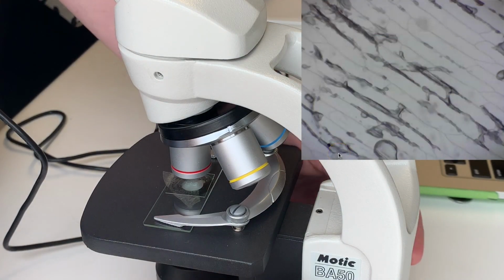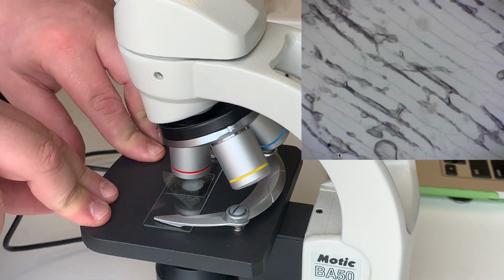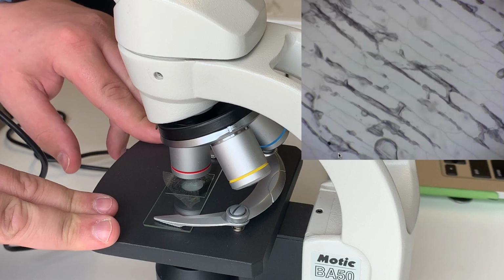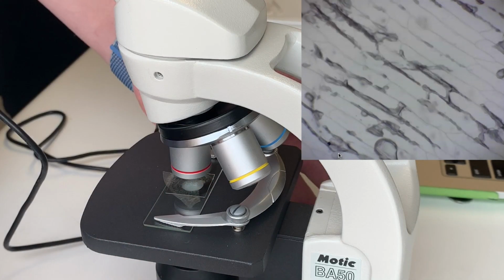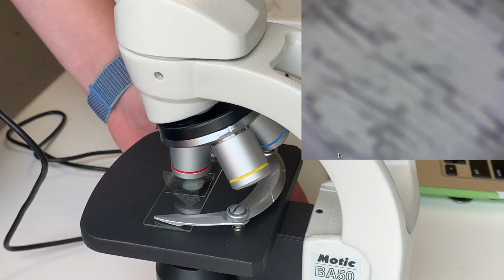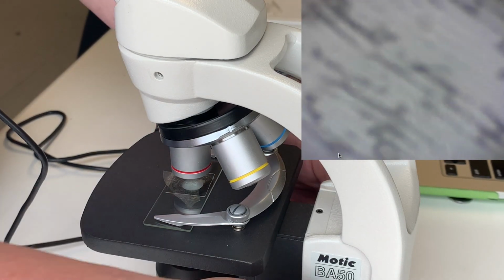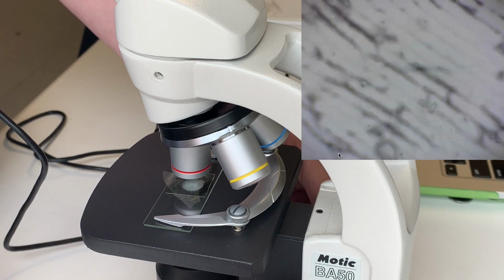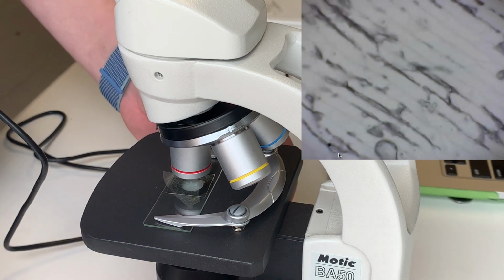So now that we're looking at the onion cell, you can see we've prepared the slide as Ms. Hogben's done before, and we've placed the slide under the microscope. We always start on the lowest magnification for the microscope, and you should always start with the stage at the highest possible point. You then want to move the stage down, and you can see through Dino Eye over here what we're looking at through the microscope.